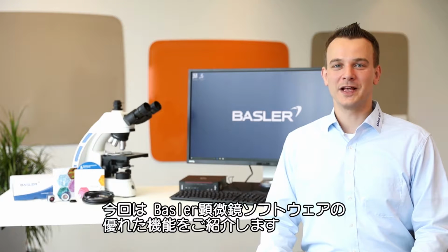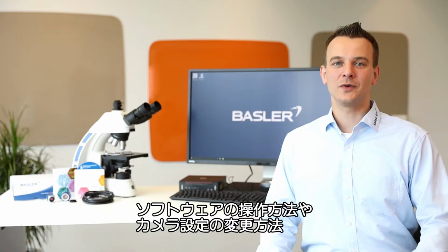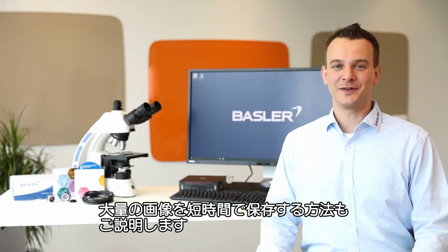In this video, we'll have a closer look at some of the powerful tools integrated into the Basler microscopy software. You will learn about the user interface, how to change or reset your software and camera settings, and how to save time when capturing even large amounts of images.